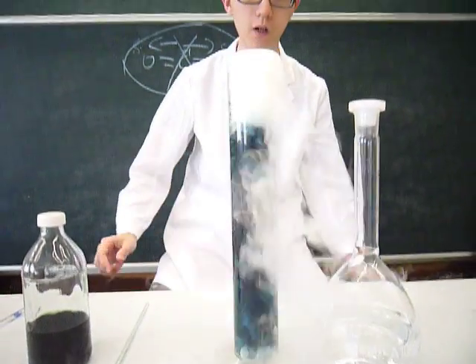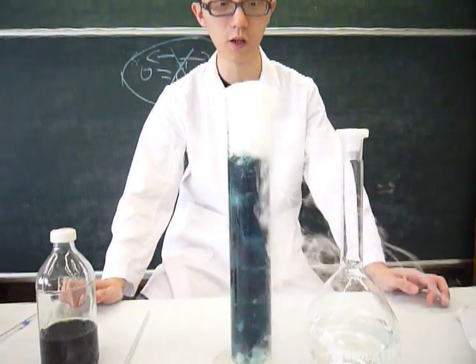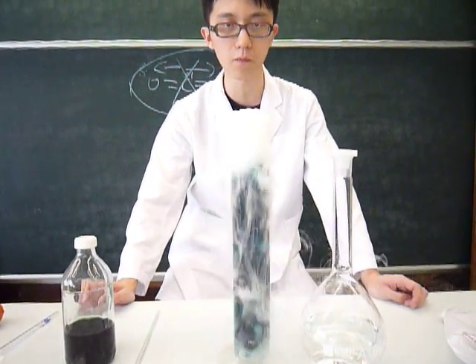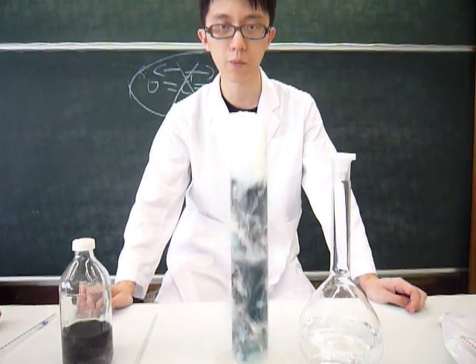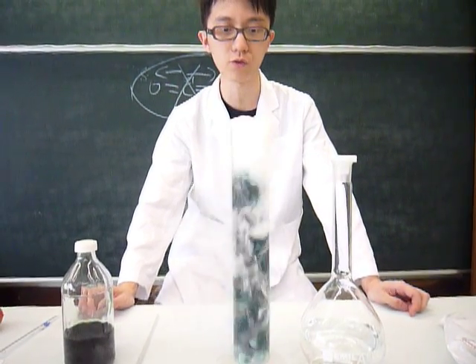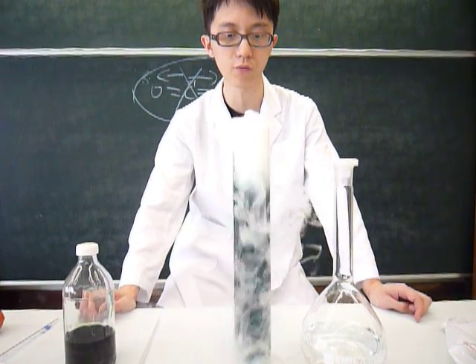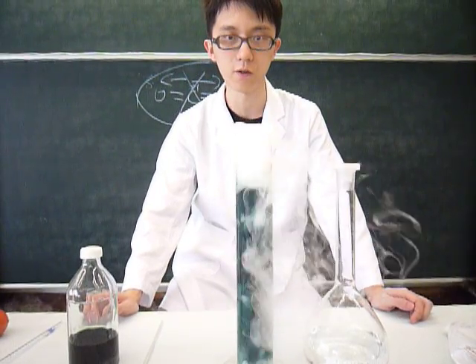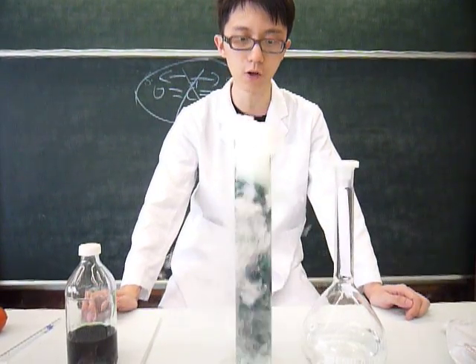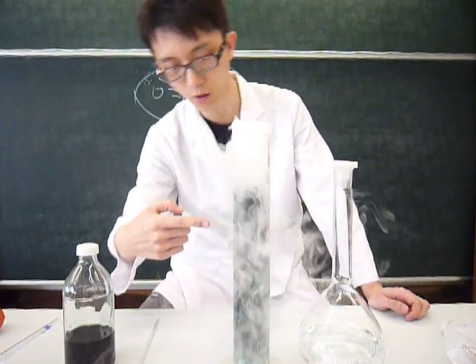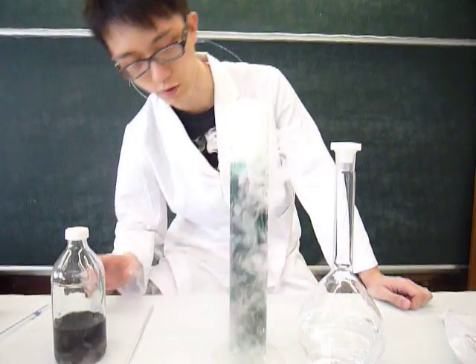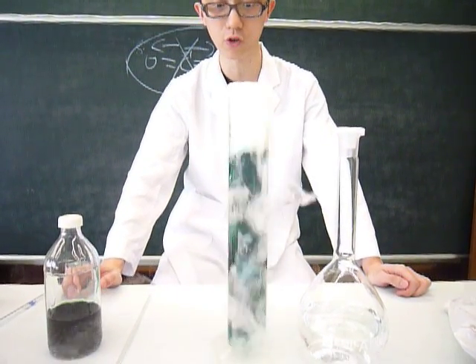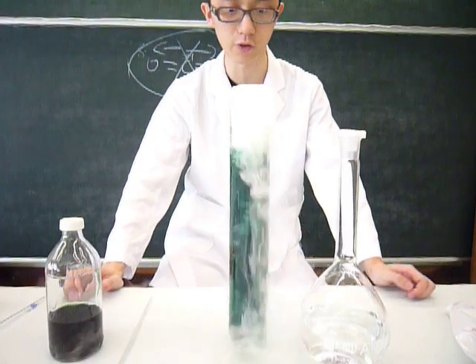Because the carbon dioxide goes in and then it dissolves in water to form carbonic acid. The carbonic acid H2CO3 then reacts with sodium hydroxide during a neutralization process. And now you can see it is green in color because it becomes a neutral solution.